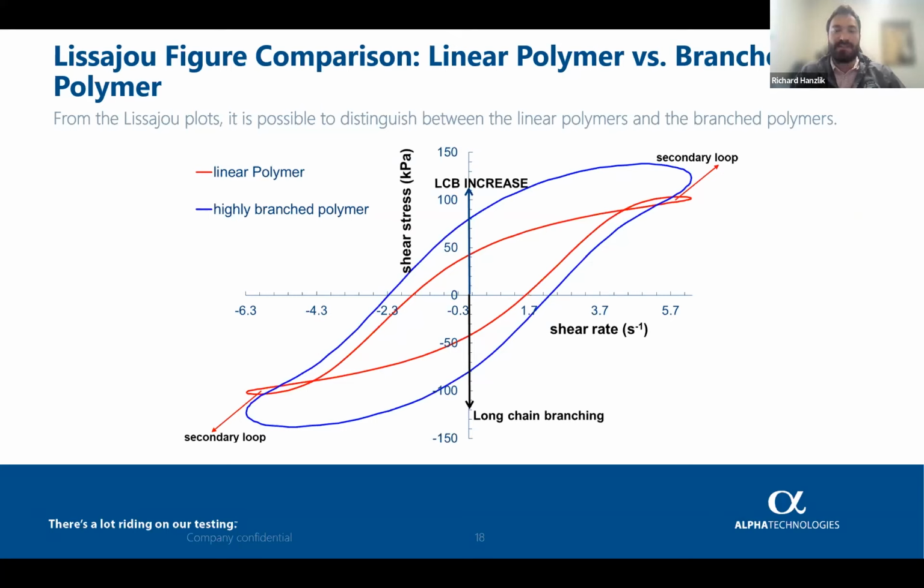As you probably know, the presence of long chain branching in a polymer has a large impact on the viscoelastic properties and can significantly influence the processability of rubber compounds. And even filled rubber compounds, for example, black incorporation time, die swell, extrusion behavior.